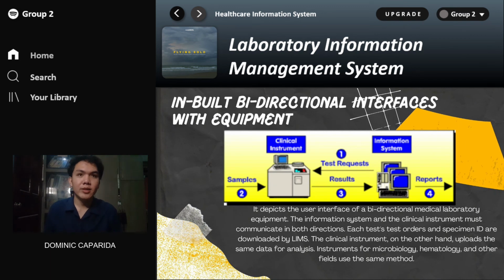So next is inbuilt bidirectional interfaces with equipment. So bidirectional, so there's two directions, and these interfaces means that it is a software where a system and another system communicate with each other. So it depicts the user interface of a bidirectional medical laboratory equipment. The information system and the clinical instrument must communicate in both directions. So each test order and specimen ID are downloaded by LIMS. The clinical instrument, on the other hand, uploads the same data for analysis.